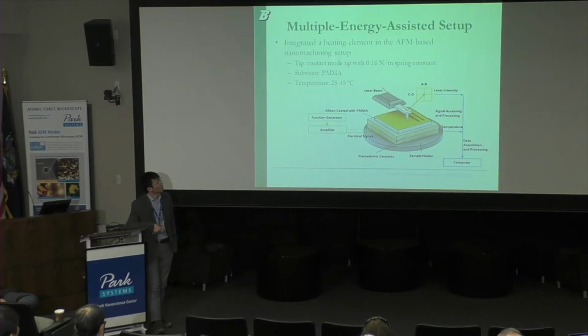Another reason is actually the tip life we just mentioned before. The tip can be used only for a while. Let's say for this pattern, maybe for 5 patterns, 10 patterns, it is going to severely wear. So the fidelity cannot be maintained all the way along these 5, 10 patterns. So that is another limitation we have for this process. So I came up with another idea, just trying to increase the lifetime of the tip to make the pattern more consistent in terms of making more patterns.